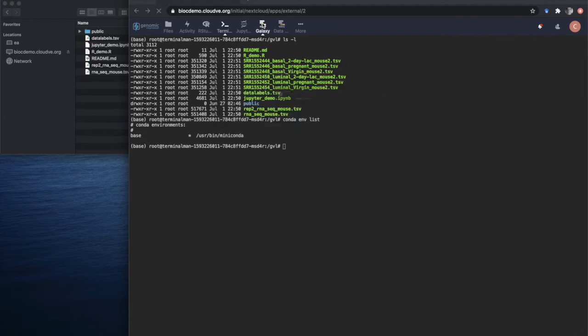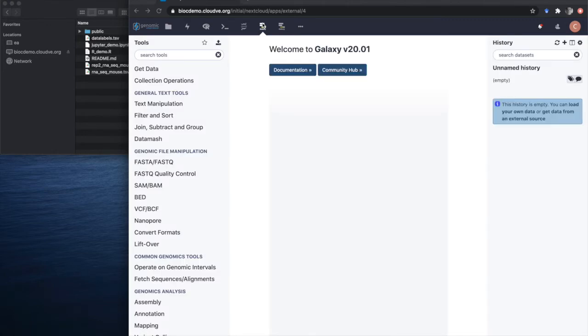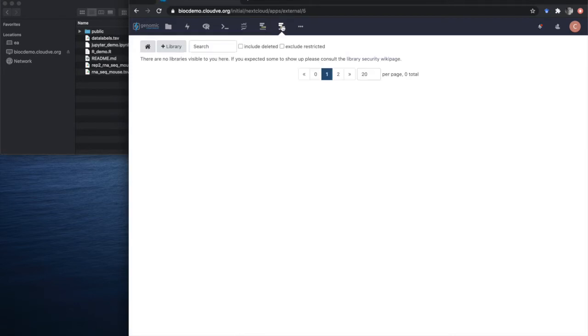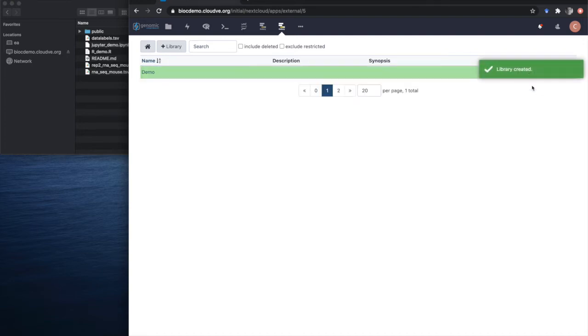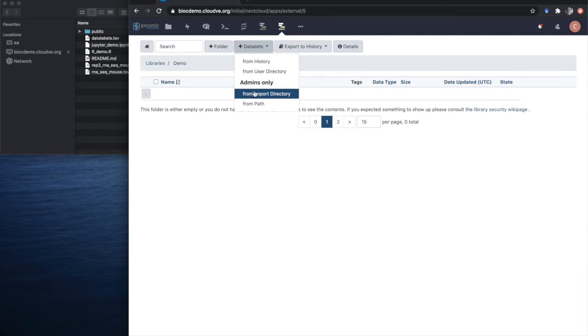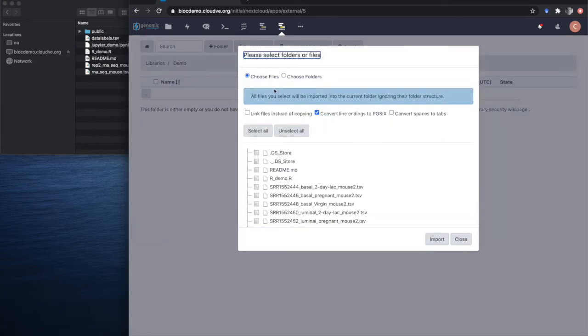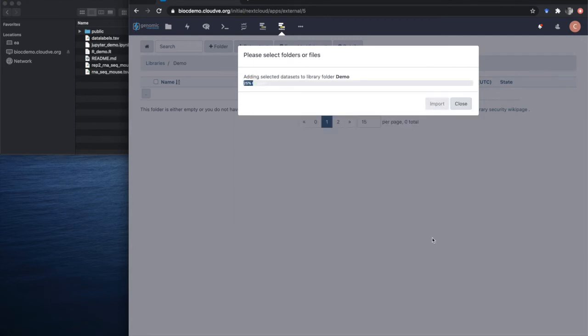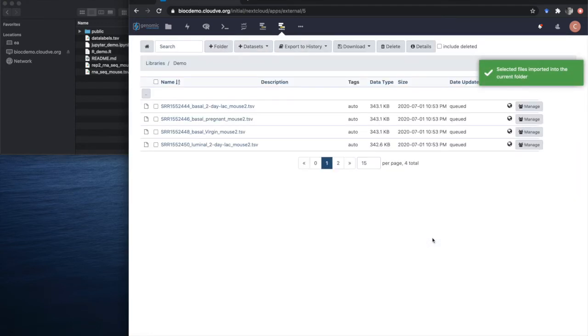Finally, there's also Galaxy as sort of the flagship application of the GVL. The Galaxy comes with its data libraries capability, which provide us a way to also browse data on the GVL. If we create a sample data library, we can then enter the library and add datasets to it. For example, in this case, we will link the datasets to save on storage and not duplicate it, select those same datasets that we created as part of RStudio and import them into our Galaxy data library.